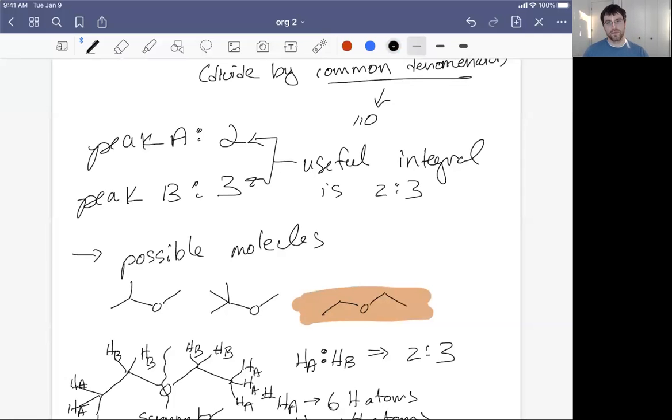Okay, so I'm trying to couple the experimental data with just understanding the chemistry. Perhaps I made this too complicated by stretching some pretty prominent examples already. The computer is going to give us a number. But what the integral is, is just a ratio of the area of the peaks based on the number of hydrogens that make up those peaks or those signals. Perhaps looking at some examples will solidify a lot of this for us. But integration is not something to worry too much about. As we practice, we'll see it start to click a little bit better.